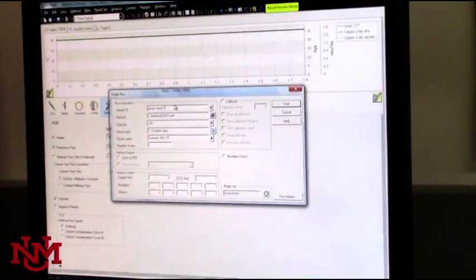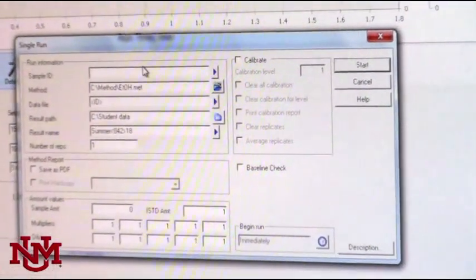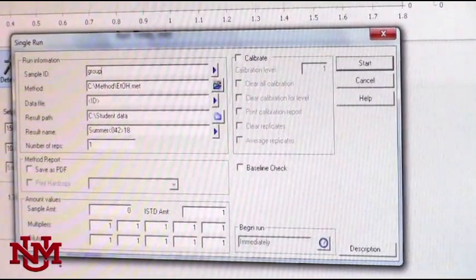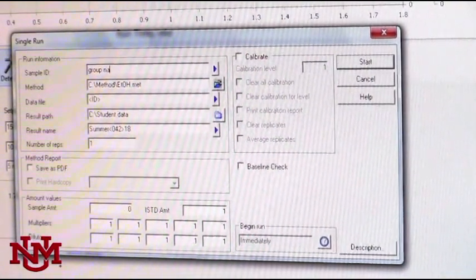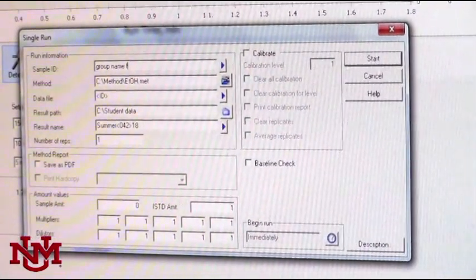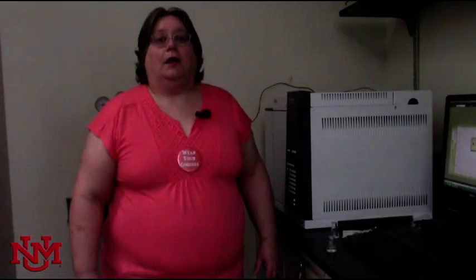You then type in your group name, followed by the letter F and the number 1. All right, you click start and the machine will start equilibrating.